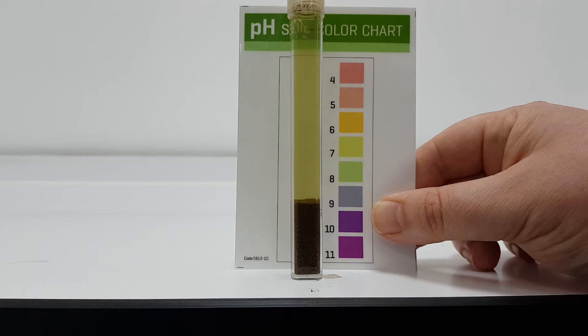The color closest to the liquid is the pH of the solution, and therefore the pH of the soil. Here, for example, we have a pH of 7.